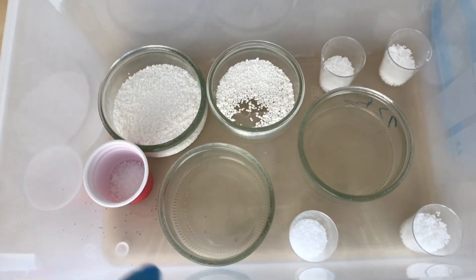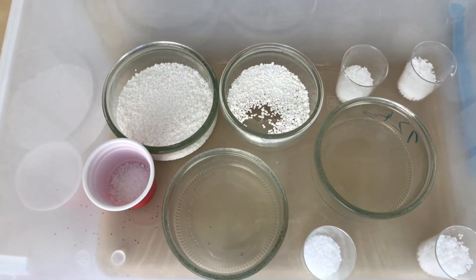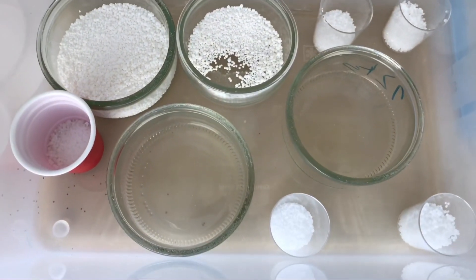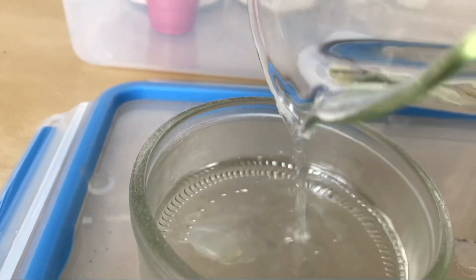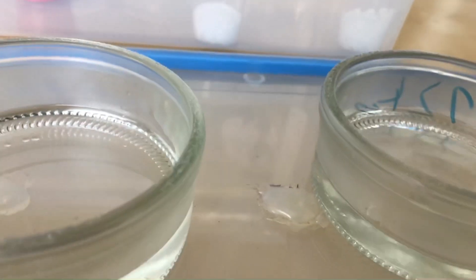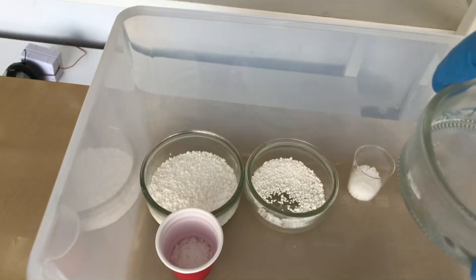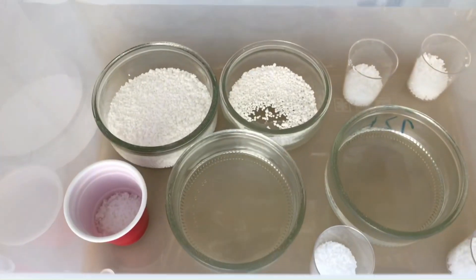A crude desiccator box was prepared using calcium chloride and sodium hydroxide to absorb all of the remaining acetic acid from the solution. The lead acetate solution was poured straight into two crystallization dishes inside the desiccator box — just half into each. We rinsed out the beaker with some distilled water and added it in as well to get the maximum yield. The dishes were then placed into the desiccator box, which was closed until nice crystals had formed.